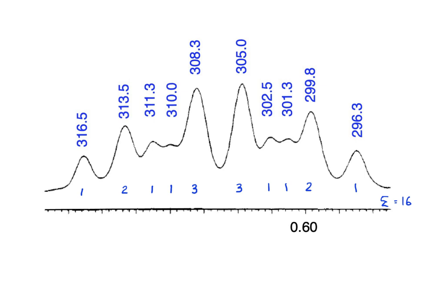The first two peaks are separated by 3 hertz. So I look for all of the 3 hertz patterns, 1 to 2 to 1 for a triplet. Here's another one that is, keep in mind it's 1 to 2 to 1, even though that second one looks, and third one is a 3.